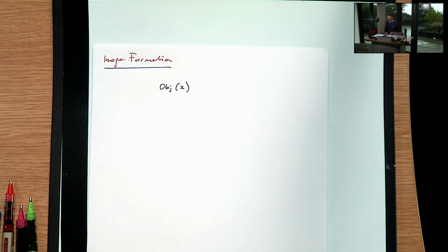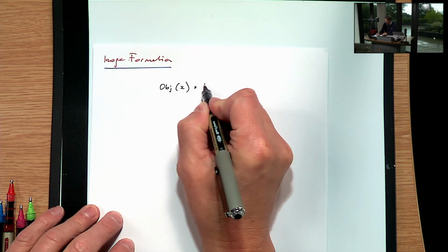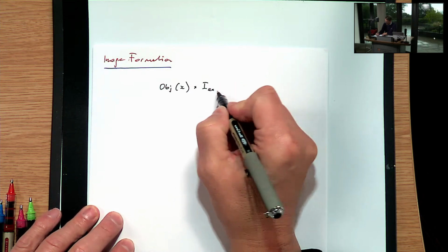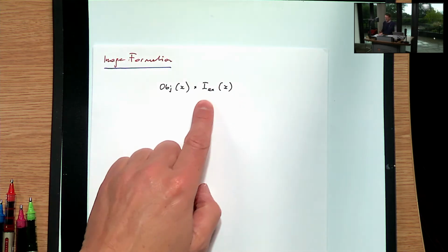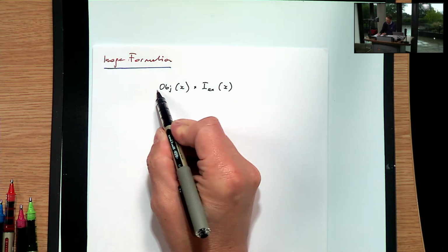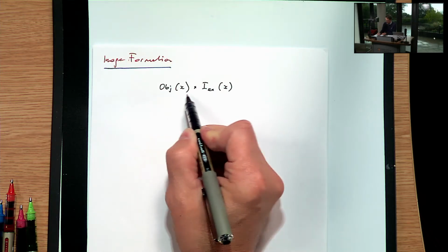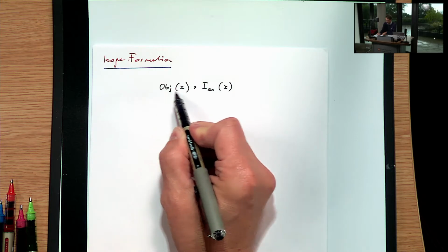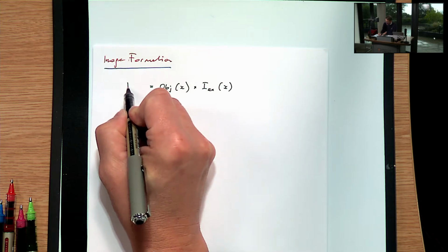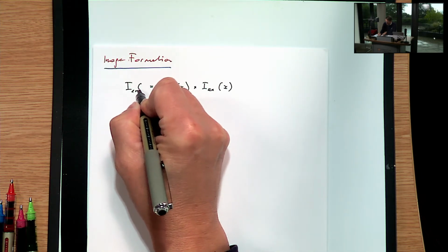The excitation intensity is described by I_ex(x) as a function of x. So this is the illumination pattern that excites the fluorophores, which are arranged as this function here in the object plane. So that would be the resulting fluorophore emission in the sample plane.